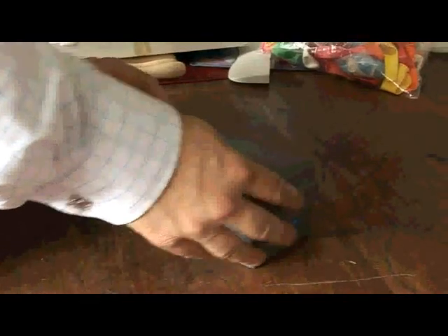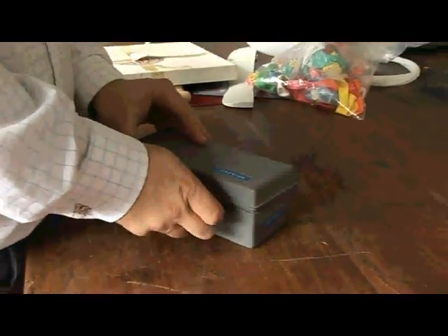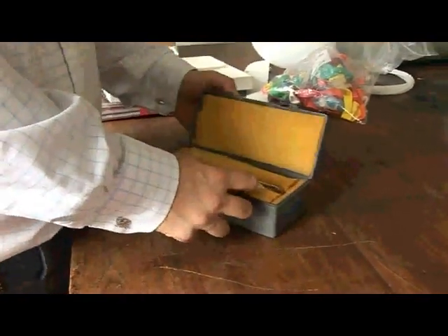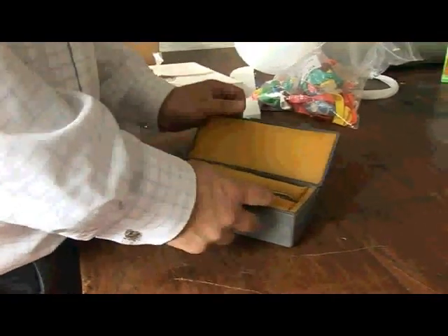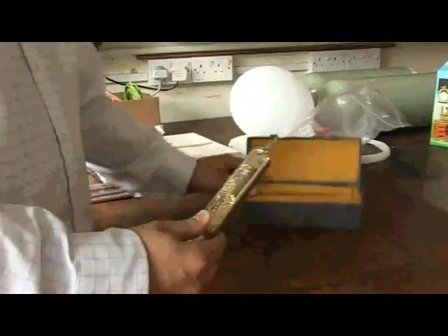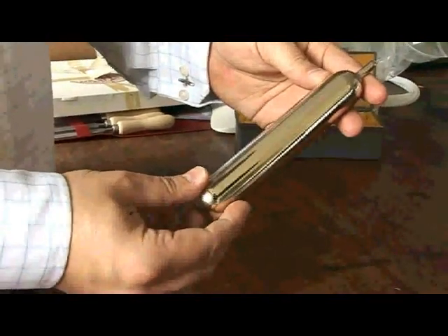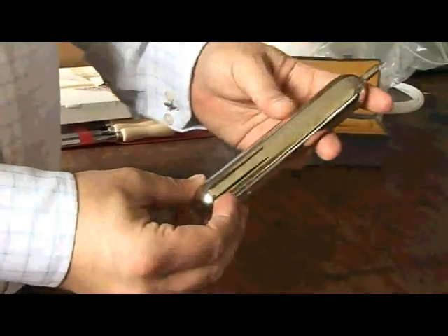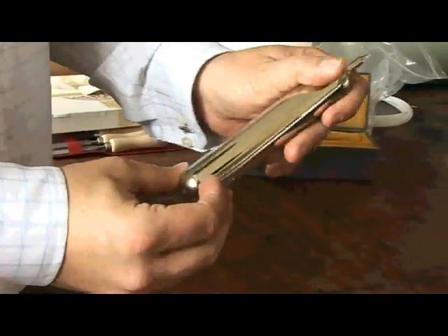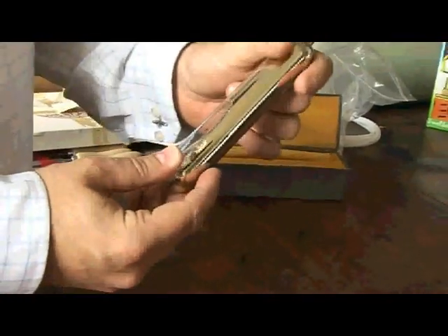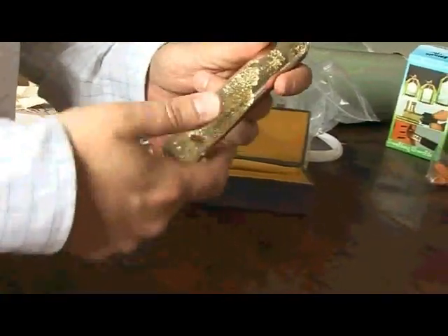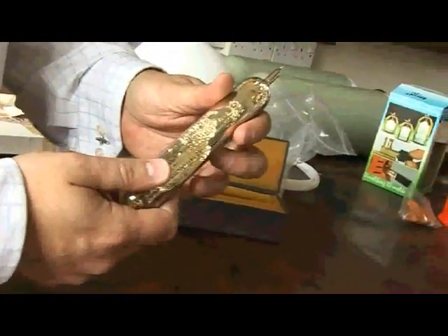So, like you say, this is like a careful box. And now we're going to open the box and you'll see that inside the foam padding is a glass ampoule of the cesium itself. And you can see that the cesium is a wonderful gold color. And you can see this is sealed in a glass ampoule under an argon atmosphere.